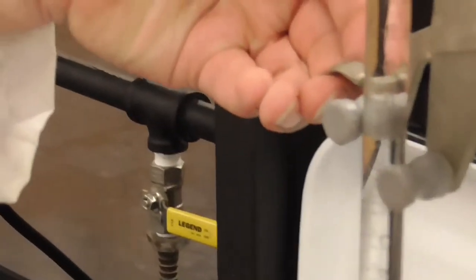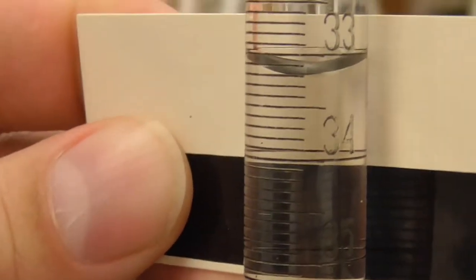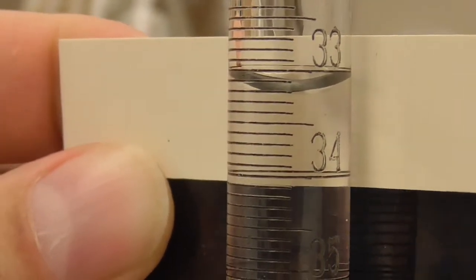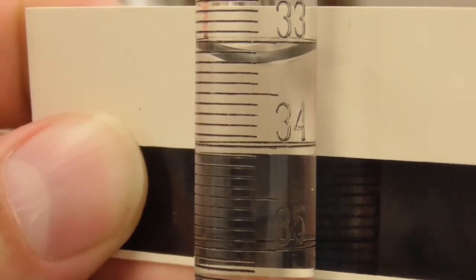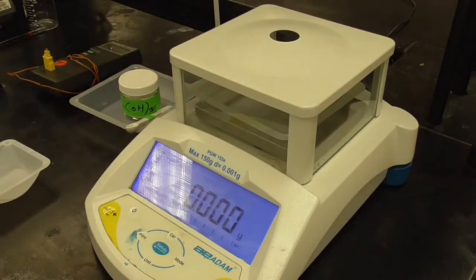I'm going to move the burette, get out of the burette clamp. Sorry, folks. I have a hard time aiming the camera just right here. Okay. All right, so now we can read the ending point on the burette for trial number 4. Okay, I'm going to pause it again while we get ready for the next piece.